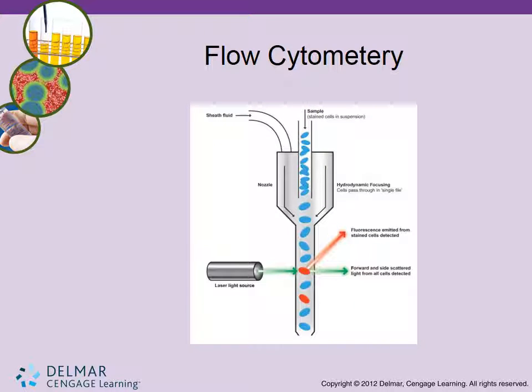Here we have the internal workings of the flow cytometer. Not a lot of difference, really, when you look at it, except for the type of light source that's used. When I say there's not a lot of difference, it's because our cells are put into a suspension of fluid, and they're channeled through the inner column of the flow cell.